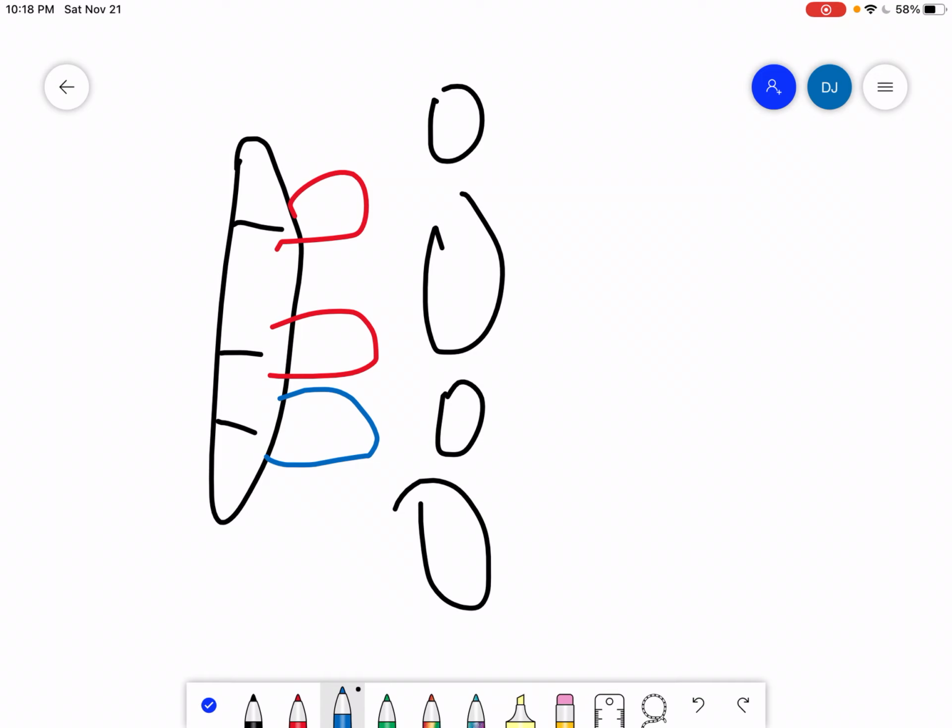Now, how do we actually separate these fragments due to their respective size? Because that's really what a restriction map is. A restriction map is essentially just a map used to separate these fragments due to their respective size. And why is this useful?